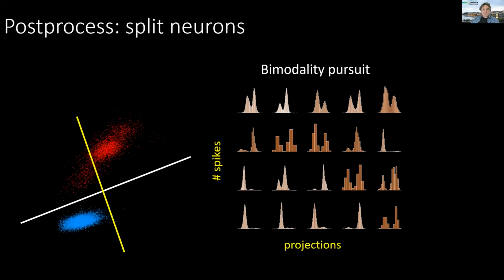We didn't know how much drift was influencing all of this. We knew it had some effect. And so after we developed these methods to correct the data and remove drift, which I think was the main thing inducing non-stationarities over time, we knew that we were now probably able to use more fancy algorithms, particularly the ones that can better deal with local minima and find small neurons, for example, that might not have a lot of spikes.